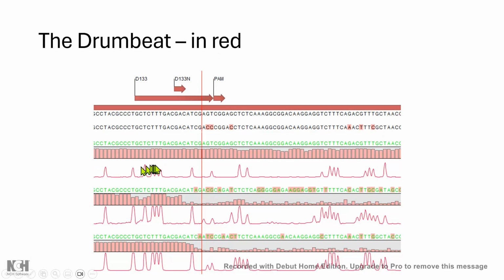So here we have the normal rhythm before, which matches for everyone. But here all you're hearing is dum, dum, dum, dum, da da dum, da da dum, dum. But if you were to listen to 2 slightly out of phase recordings of that same track, here is where it gets educational. So in this case down here, we actually lost 2 nucleotides. So that single drum beat, as well as still being there, hey, we get 2 seconds early, or 2 bases early, and this dum, dum becomes dum, dum, dum. So that also corroborates what you're seeing.